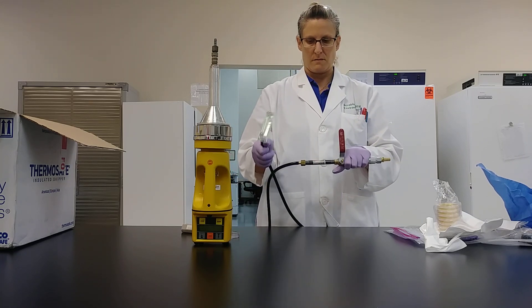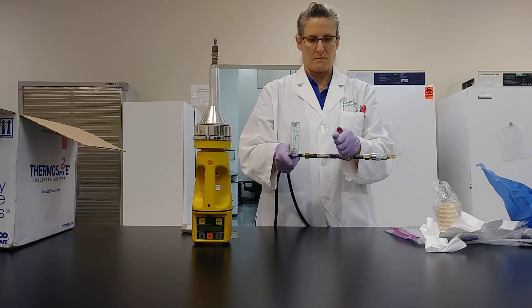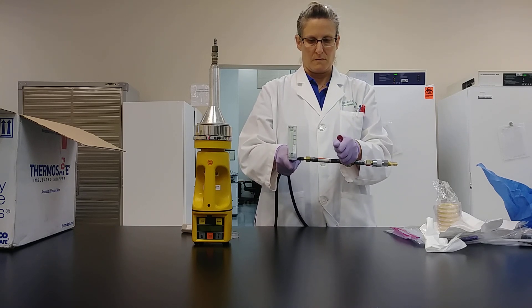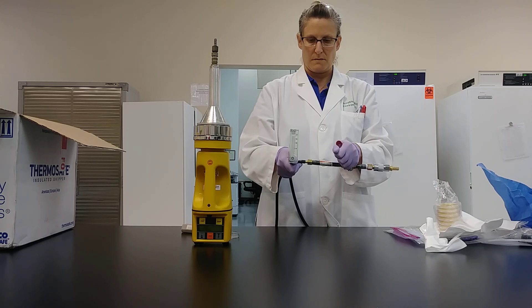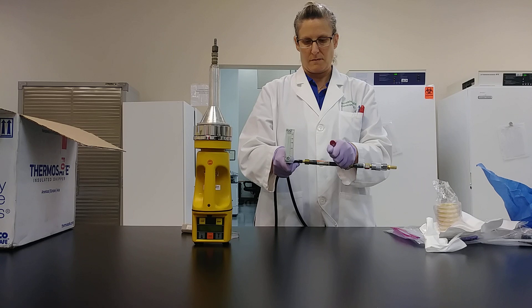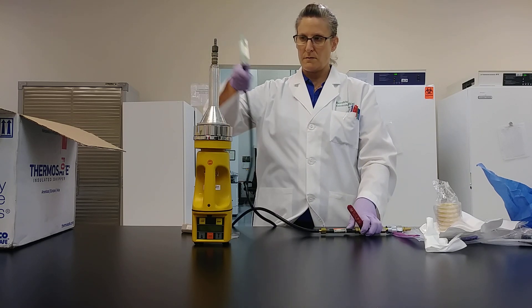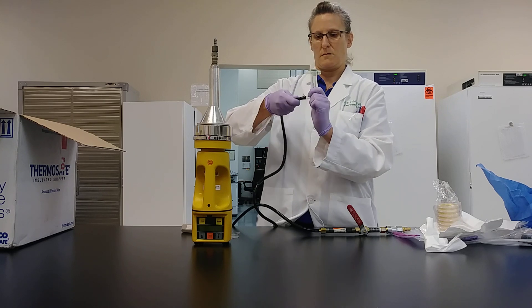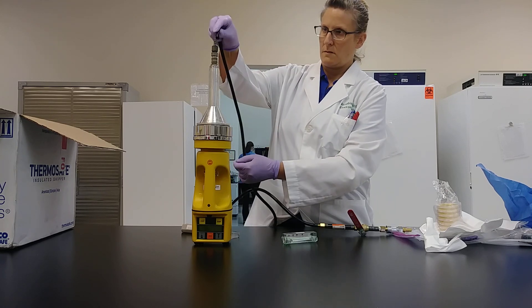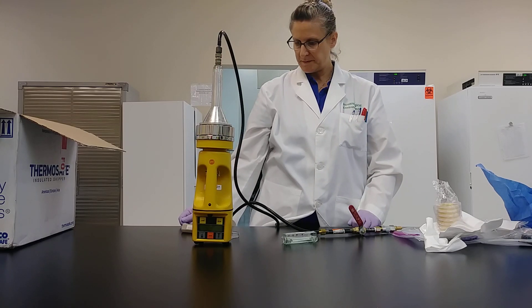Now to regulate the volume of air sample, slowly rotate the red handle so that the ball bearing of the flow meter reads at 100 liters per minute. Once your reading is stable, remove the tubing from the flow meter and connect it to the SAS nose, and immediately start your timer.